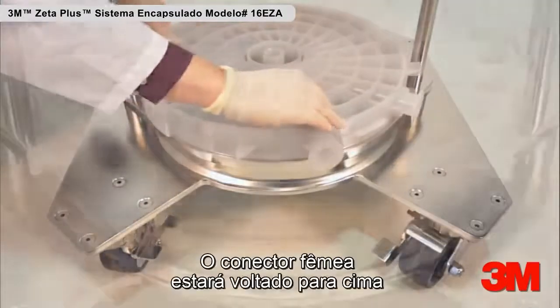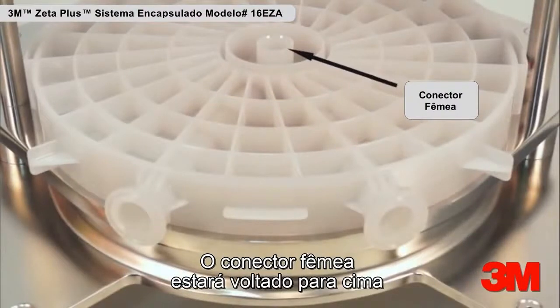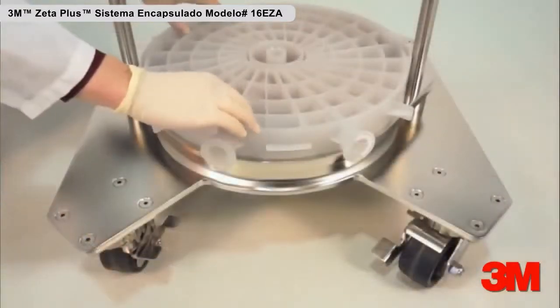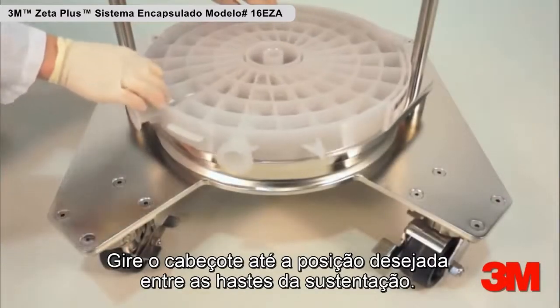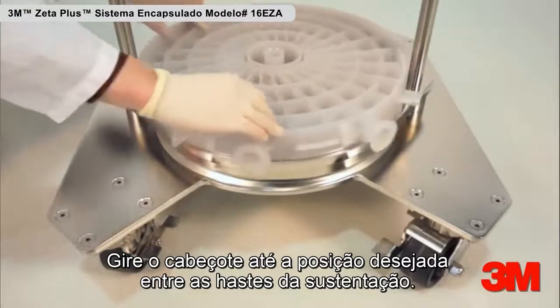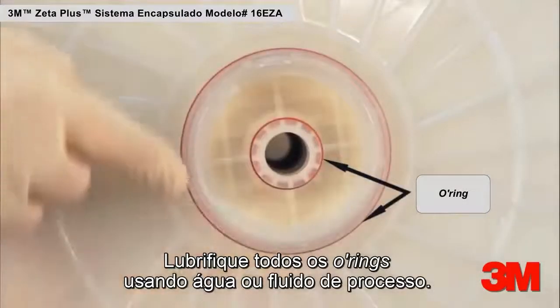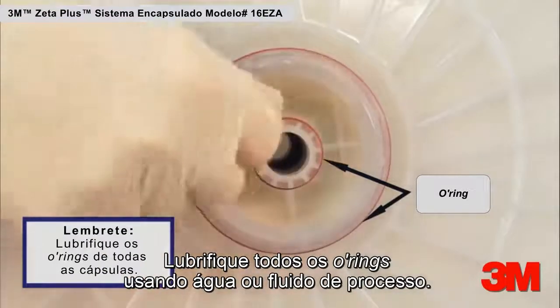The female connector of the manifold will face upward when the bottom manifold is in the correct orientation. Rotate the manifold to the desired location within the support rods. Lubricate all O-rings using water or process fluid.